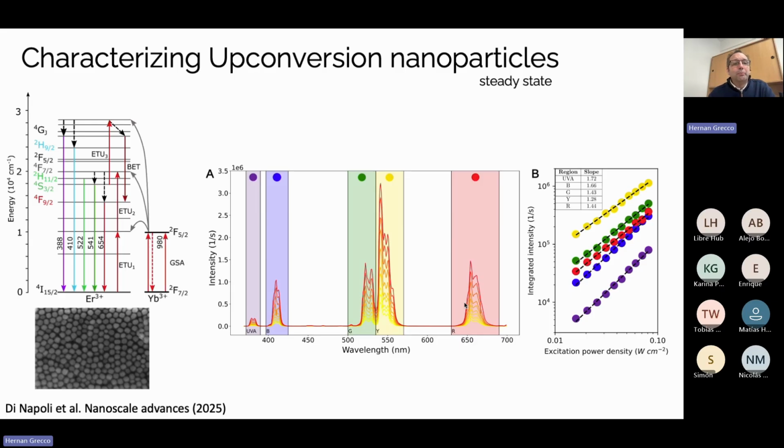And not only were we able to redo measurements that were done before, but we also gave this device new tools. For example, we generated a way of characterizing upconversion nanoparticles, which are nanoparticles built, for example, from erbium and ytterbium. You excite with infrared light, and they emit visible light. That type of measurement was not possible in the original instrument, but because we were able to change the original instrument, we were able to add more capabilities.